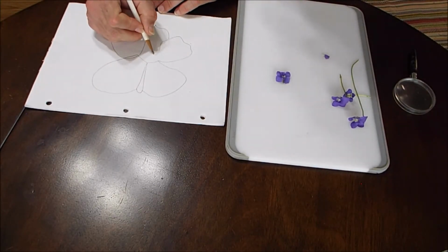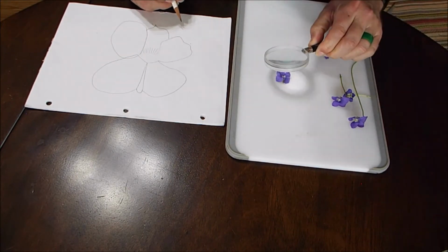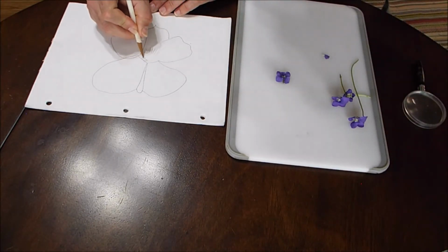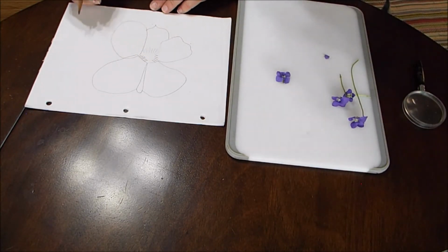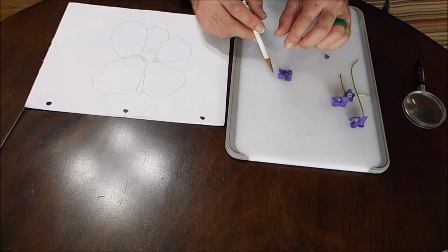I see a lot of lines radiating out on this lower lip, and those are nectar guides. Now I draw little fuzzies, and I kind of want to get a better look at them. They're kind of pointing in from the outside. So if I draw that, then basically there they are. I'm going to flip that over and take a look at it. Yeah, that's just the rear of the flower.